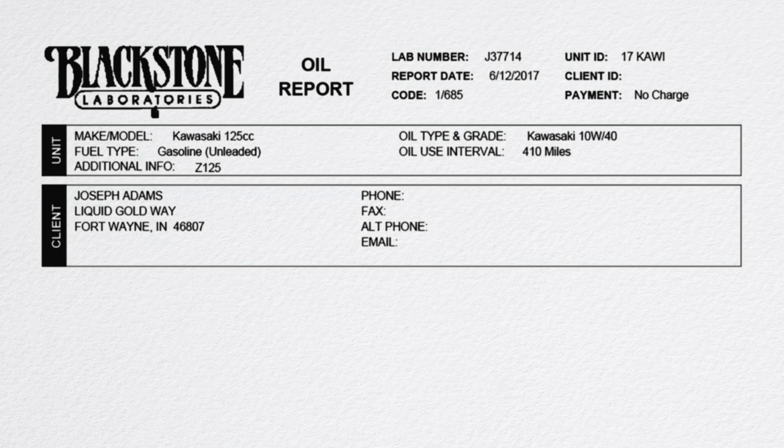Sometimes we have a sample arrive with a blank slip. Sometimes we have results that are outright concerning. We want to give, say, an aircraft owner a heads up about results that are troubling. Whatever the case may be, make yourself available with a phone number or email address. Obviously, if you want that report emailed, we have to have that address handy, but there are other means to deliver that report. Address info, obviously important for delivery of kits or your next sample.